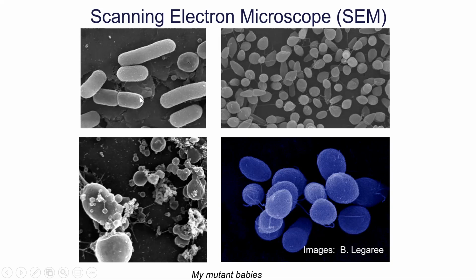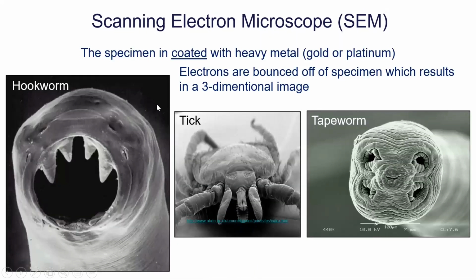I'll show you some more images here. Here's some more parasites, a hookworm. That one is absolutely terrifying. Every time I see that picture, I just think I would never want to be found in the dark with one. There's a tick, there's a tapeworm, another type of tapeworm. And this is something that you see a lot, people looking at insects and bugs, because they're very, very interesting details. Kind of wish I'd thrown a mosquito on when I was doing the microscopy. Never thought about it at the time.